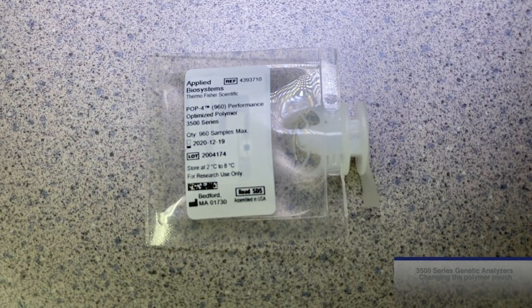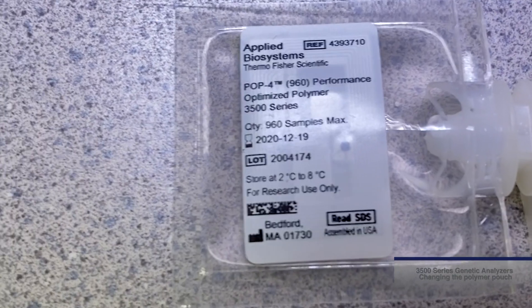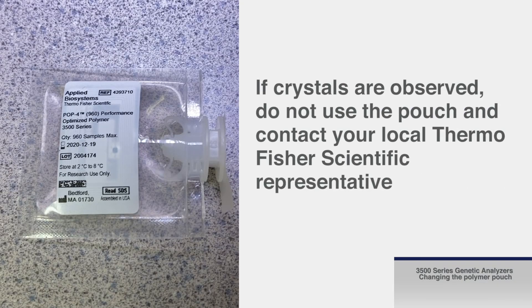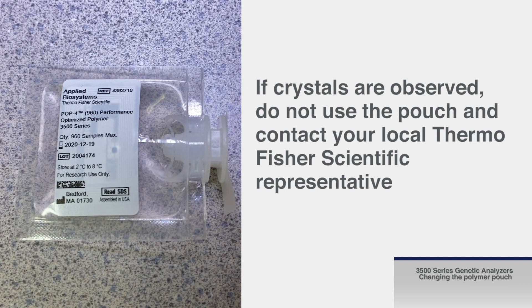Before allowing the pouch to come to room temperature, inspect the polymer pouch to ensure that no crystals are present. If crystals are observed, do not use the pouch and contact your local ThermoFisher Scientific representative.